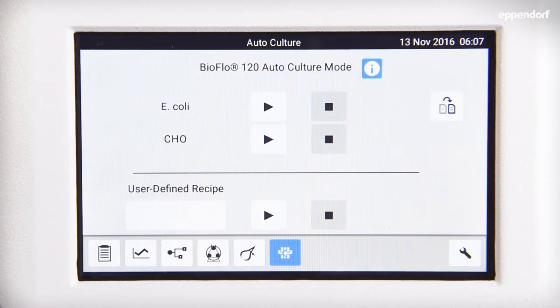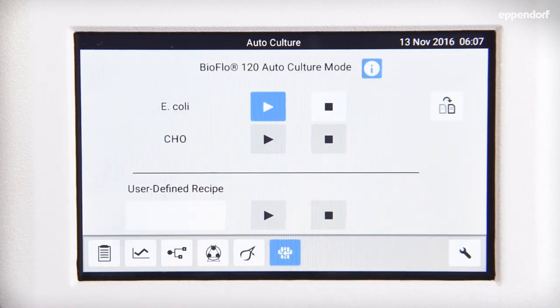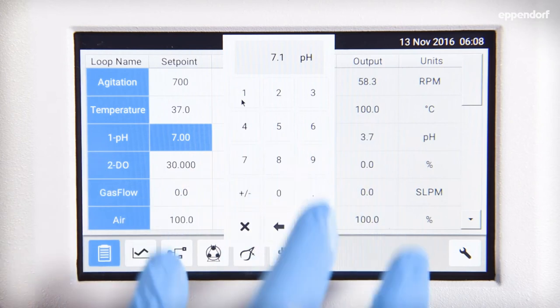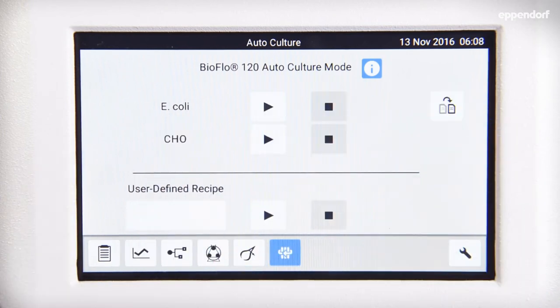The AutoCulture feature removes the learning curve associated with new equipment. Once you are ready to begin your process, simply press the play button and run through a short series of reminders. Once active, you can sit back and relax — or don't. The AutoCulture mode is designed to evolve with your process, not restrict it. Values can be adjusted and saved as a user-defined recipe stored in the AutoCulture library for later use. Once your process is complete, simply press the stop button to deactivate the AutoCulture mode, and all modes of operation will be set to the off position, ready and waiting for the next process to begin.